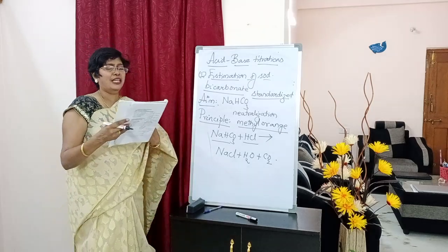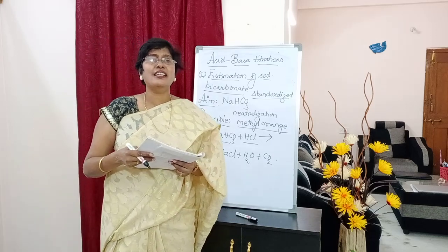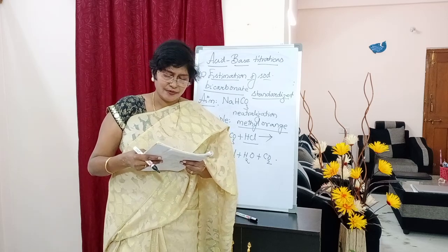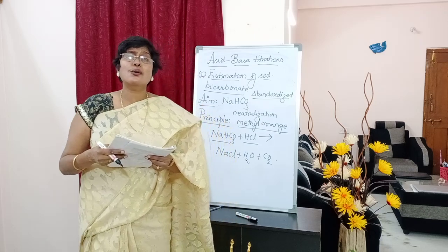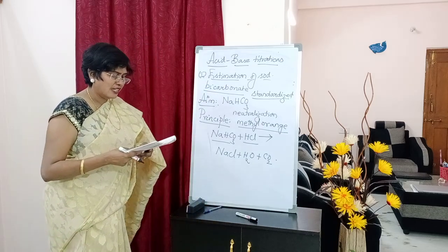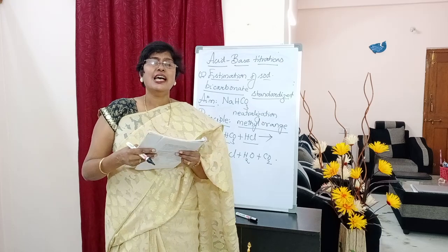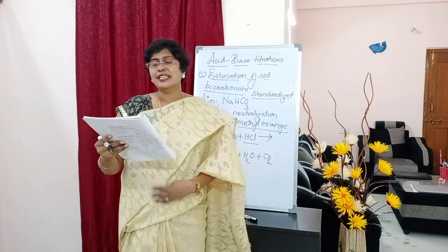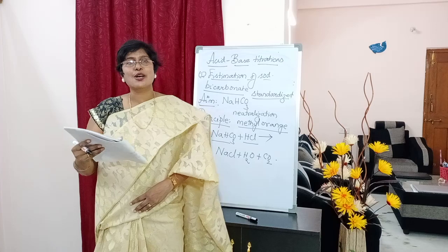HCl can be standardized by titrating against standard sodium carbonate, and the unknown sodium bicarbonate can be estimated using standardized HCl. Full stop.